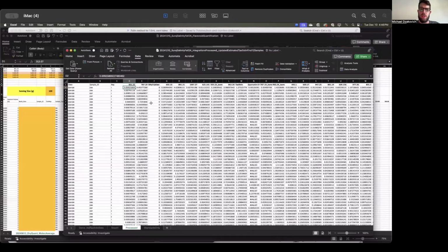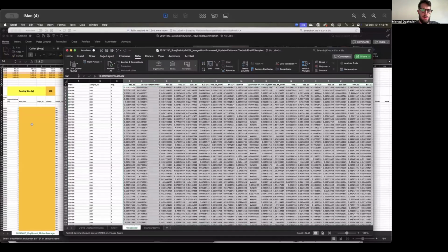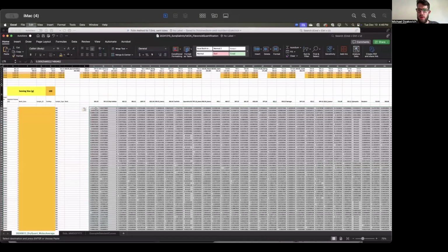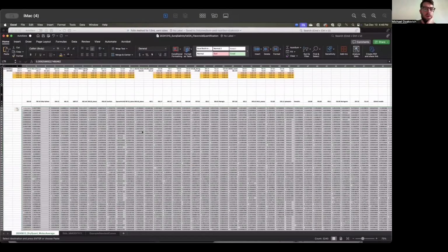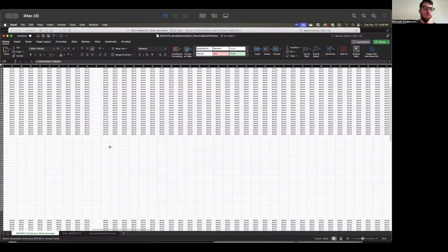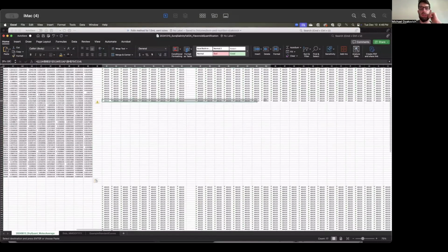Okay, we're back. So copy this over and paste right in there. There we go, nice and lined up now. Okay, perfect. So now we have our peak areas pasted in. One thing we'll have to do is pull down these formulas because, again, I didn't do all of that yet. So we can go all the way across here.